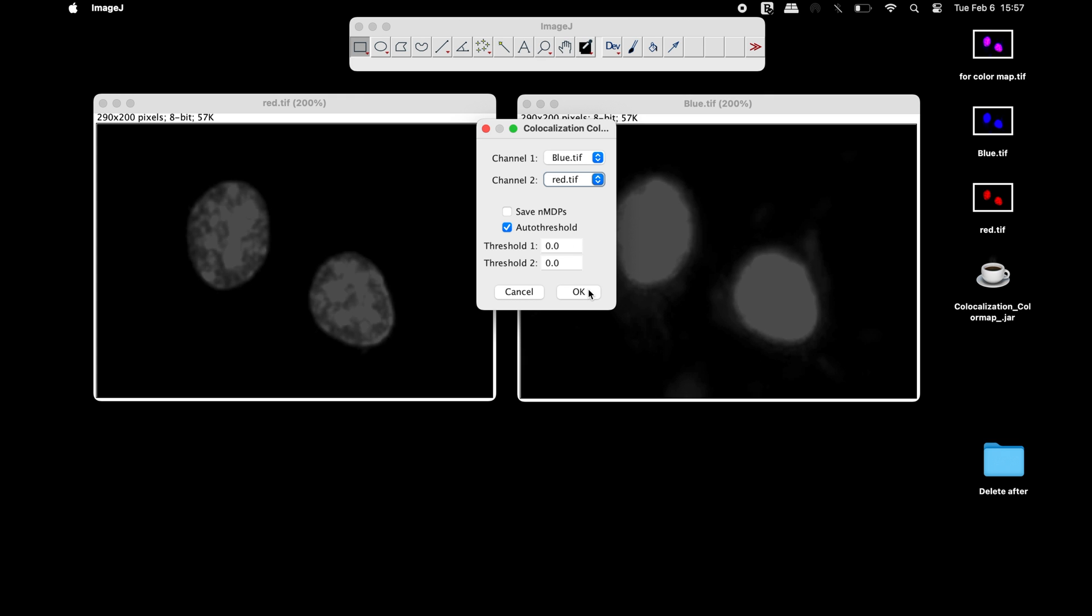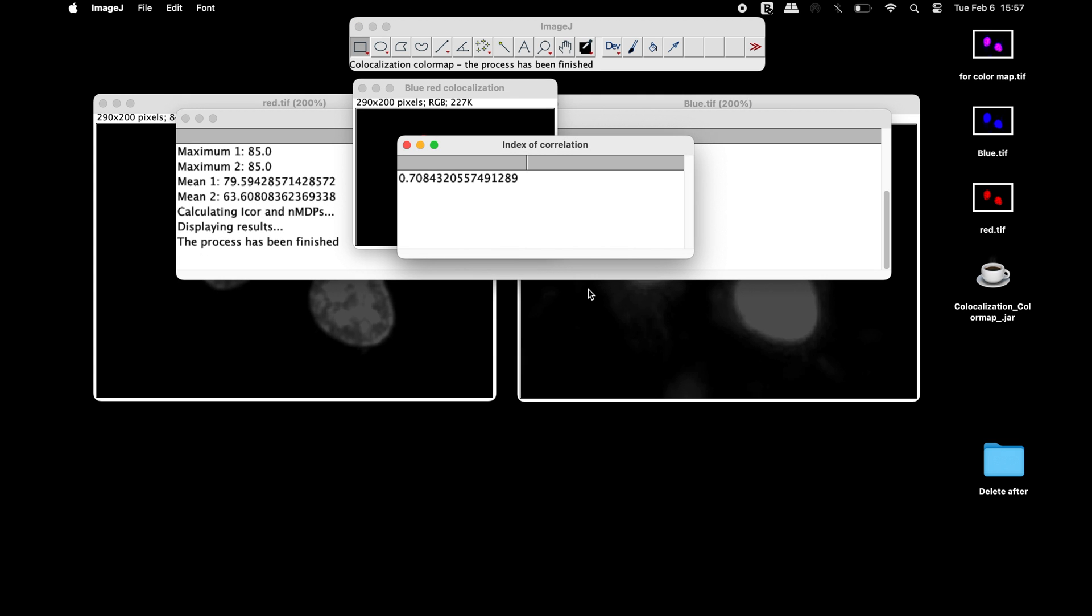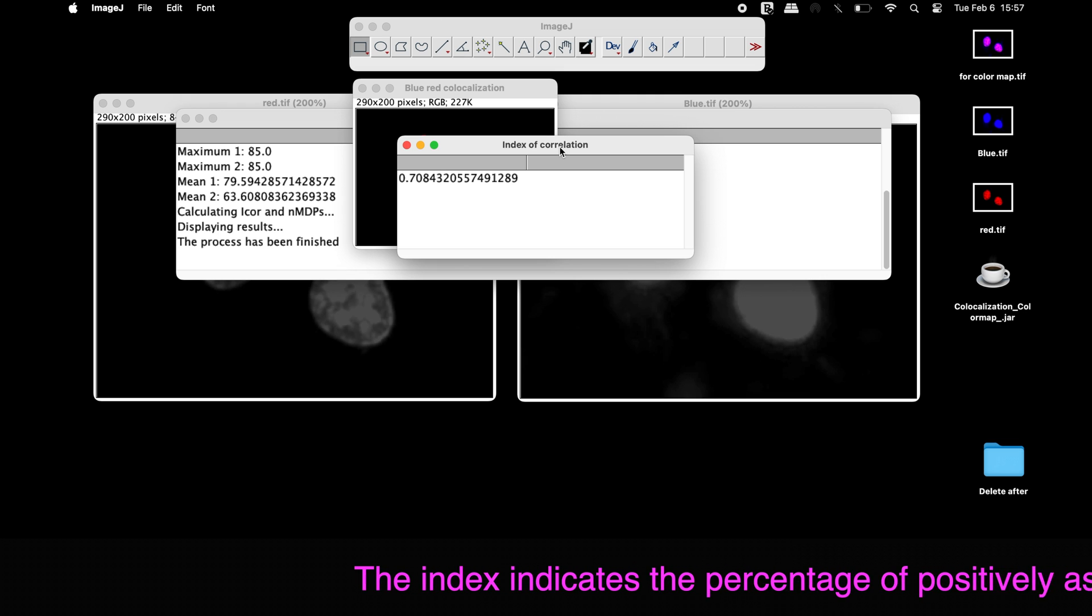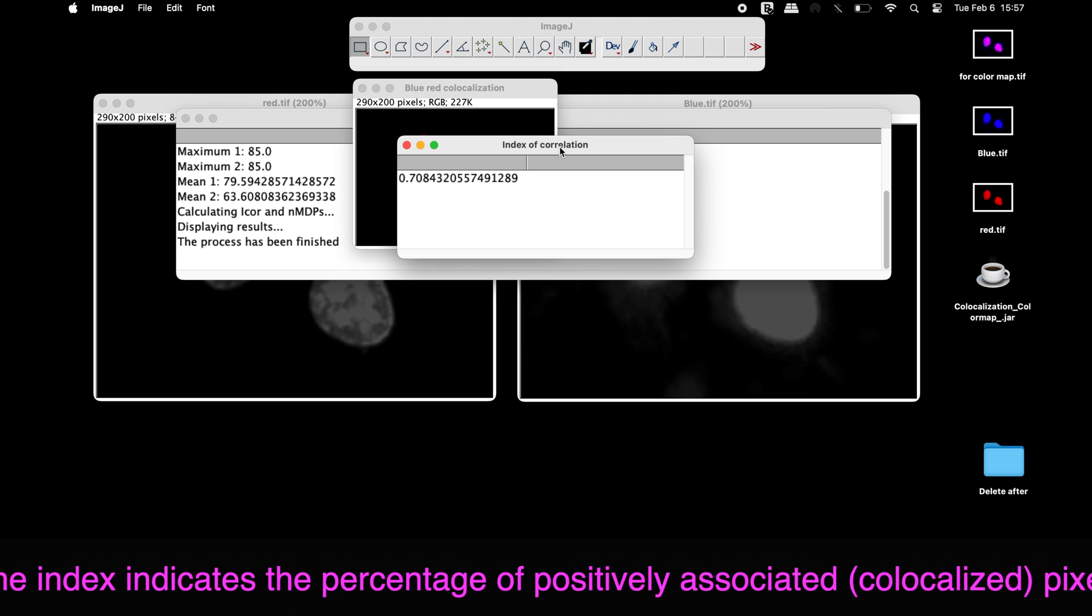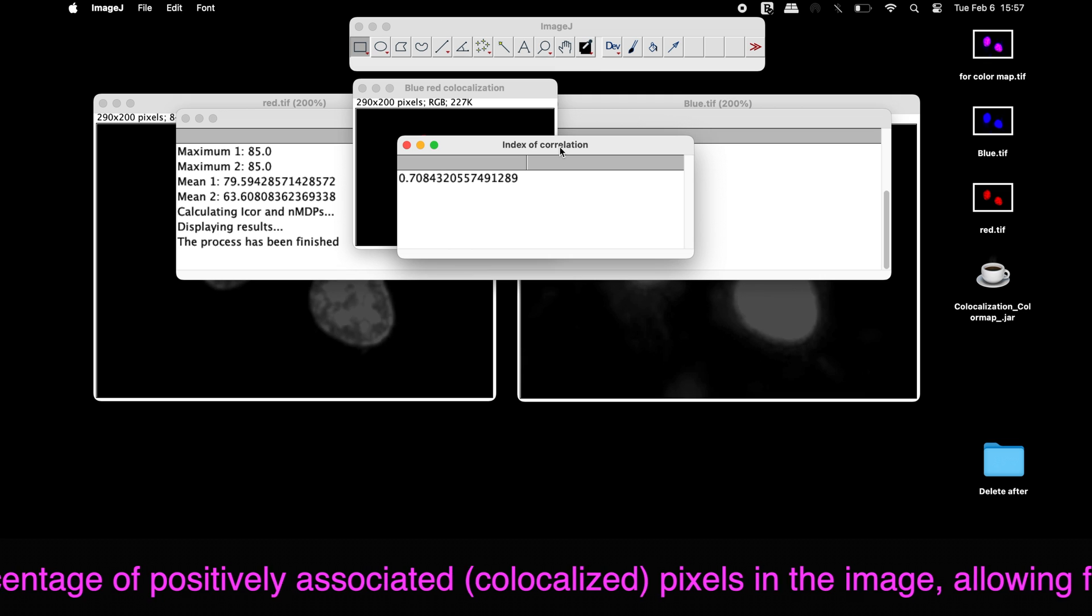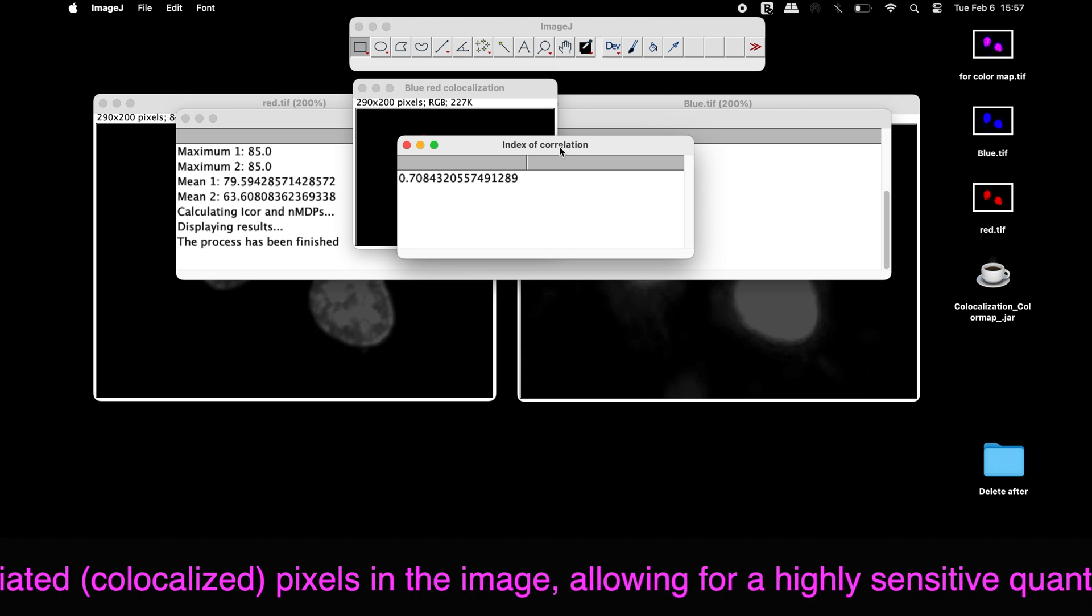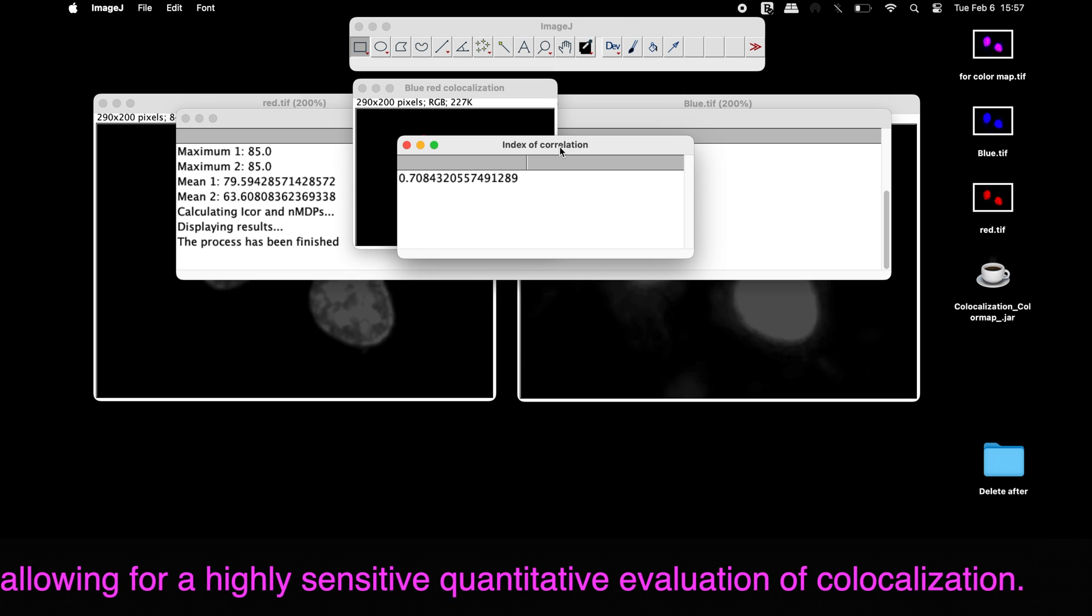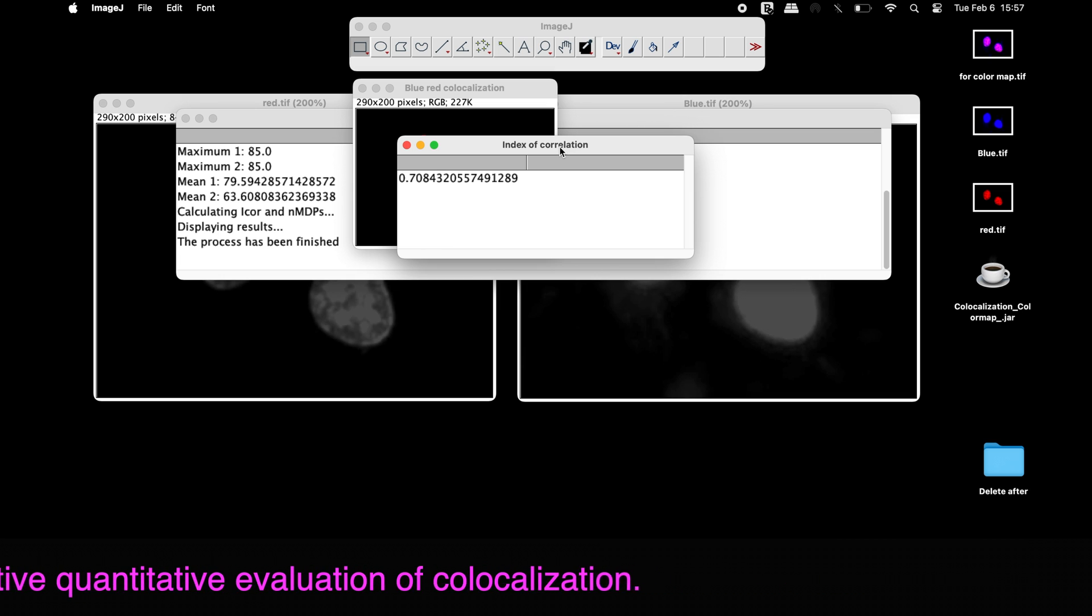Now click OK. The plugin calculates the index of correlation. The index indicates the percentages of positively associated, that is co-localized pixels in the image, allowing for a highly sensitive quantitative evaluation of co-localization.